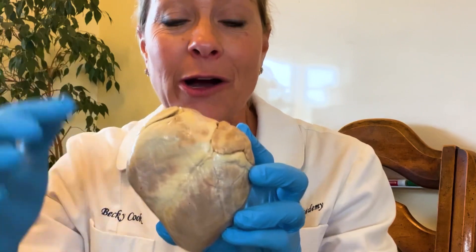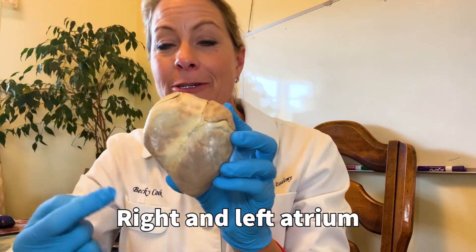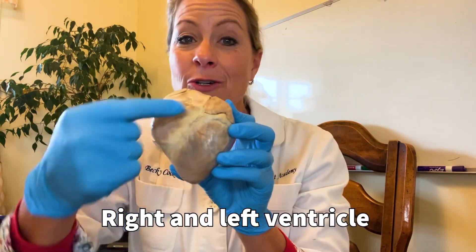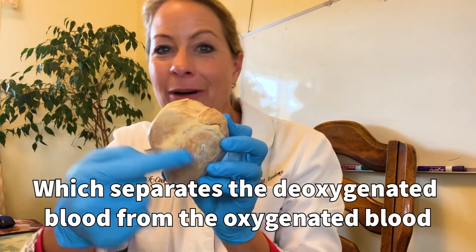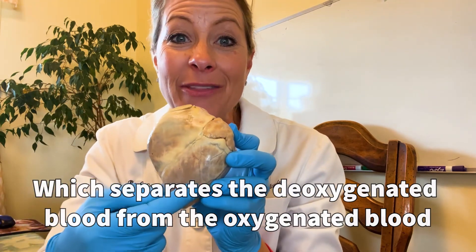I'm so excited because in this heart you can see already from the outside we have the right atrium, left atrium, and down here we have the right ventricle and the left ventricle with the interventricular septum going right down the middle, which separates the deoxygenated blood from the oxygenated blood on the other side.